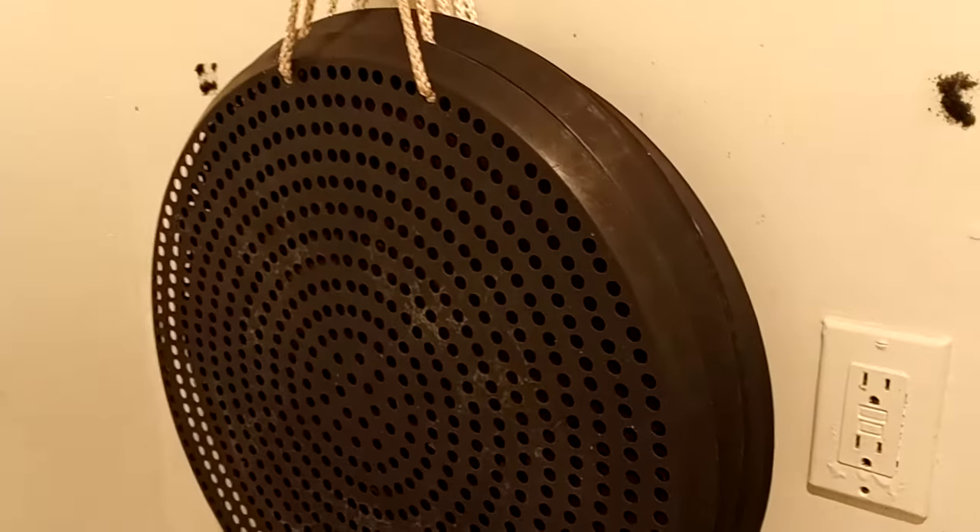We started with a stainless steel 55-gallon drum. If you look inside you'll see we've got these little spacers — 2x4s — that we use as spacers for all the shelves, which are made of these perforated anodized hard baking sheets. I'll leave a link to where you can get those in the video. I'm going to take out the bottom one — you can see it's a little dirty down there, but essentially we just got them propped up on a few 2x4s to keep them above the ground.